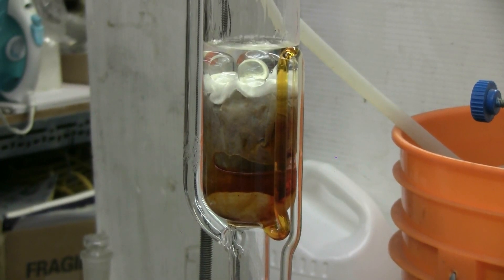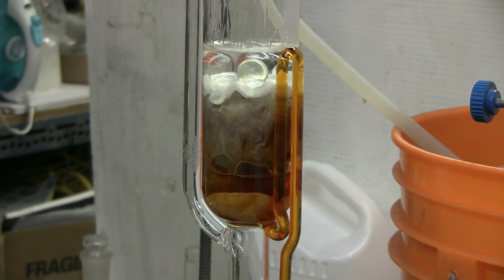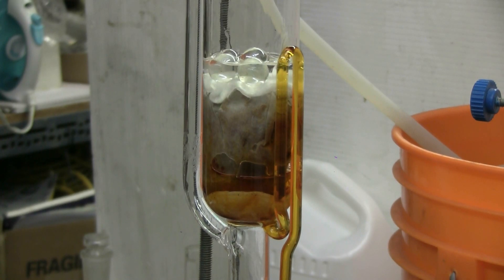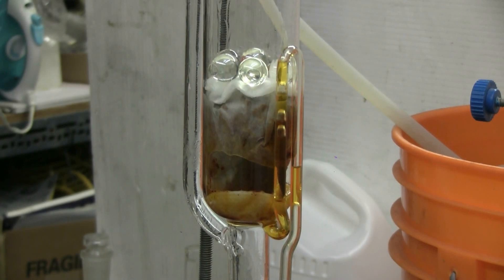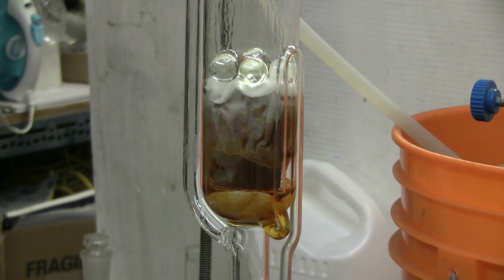This is cycle 20 of the Soxhlet extraction of powdered sweet paprika using ethanol. We can see that the extract is a lighter color — it's a yellow-orange now rather than a deep orange-brown — and the paprika in the extraction chamber is fading steadily in color, although it's still giving a good extract. I'll pick up the video again at cycle number 30.